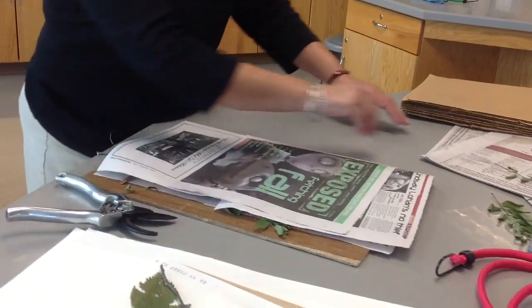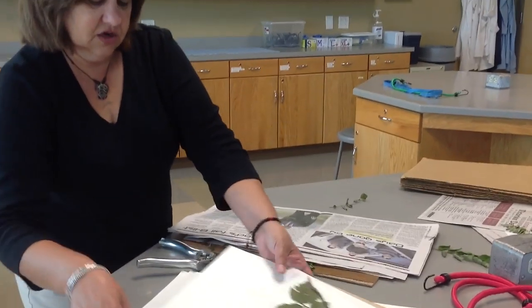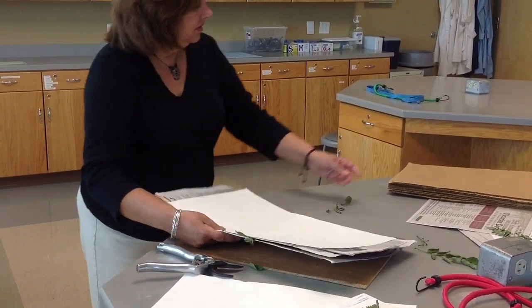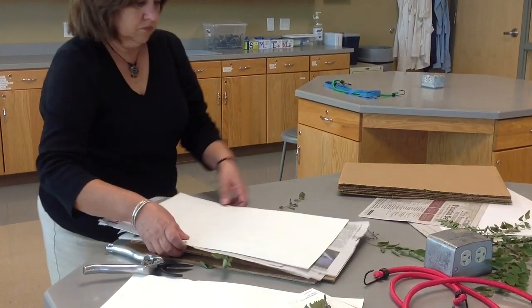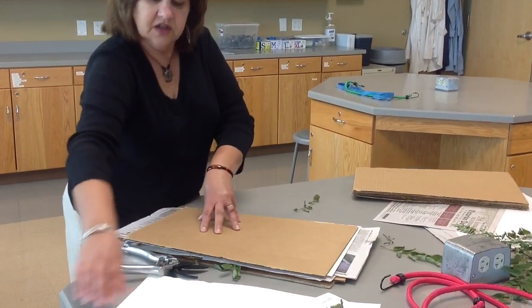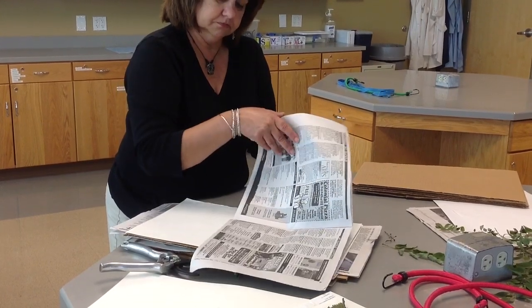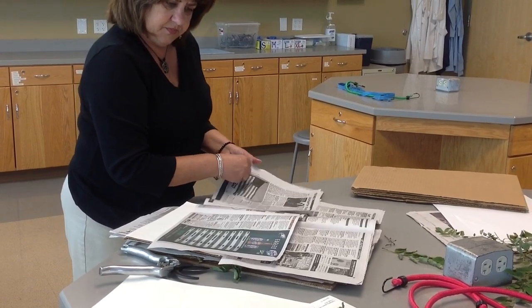Now I have my tree sample in the newspaper. I can put a couple more sheets of newspaper on either side if needed, and I'll sandwich that newspaper between felts and cardboard. Then I can move on to my next sample — it's like making a sandwich. Put more newspaper and press the next sample.